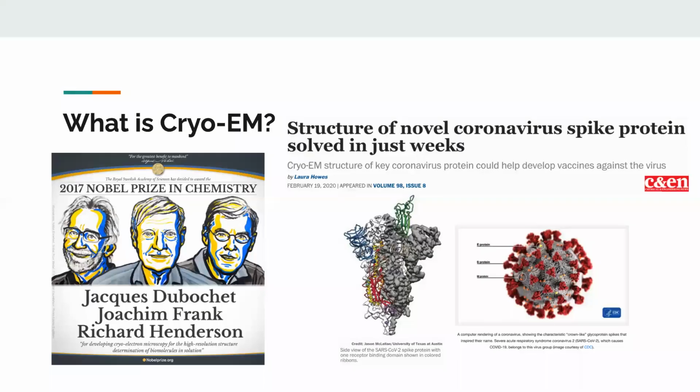First, what is Cryo-EM? Cryo-EM is a Nobel Prize-winning imaging method which is used to image biomolecular structures such as proteins at near atomic level. Being able to see proteins can help determine how they function. Recognizing protein structure and function is essential for scientists trying to design better drugs to tackle some of the world's most devastating diseases, including HIV, cancer, and most recently, SARS-CoV-2.